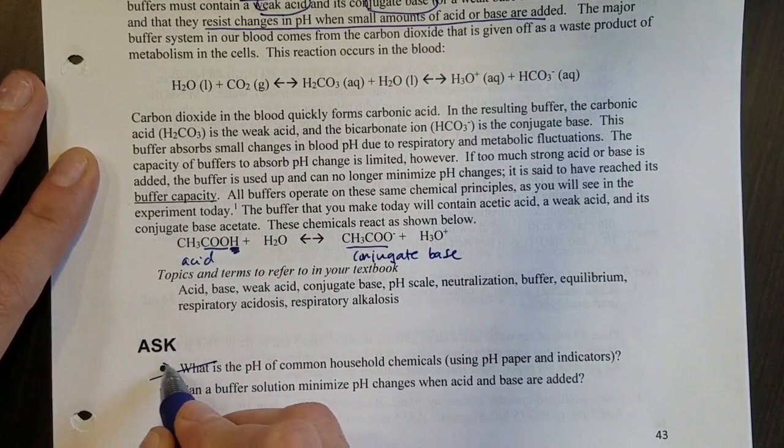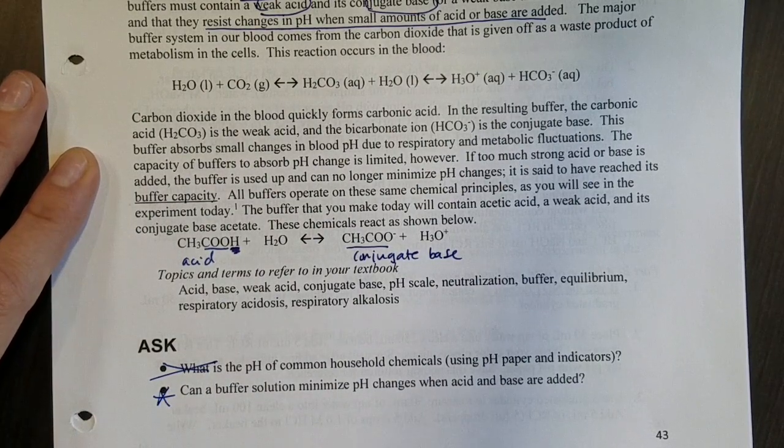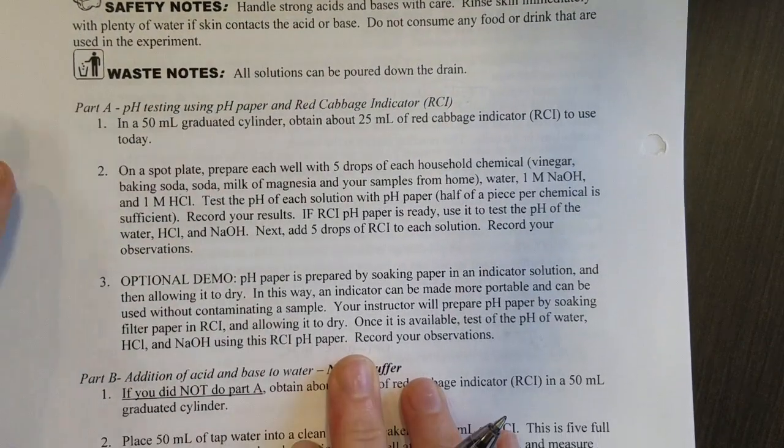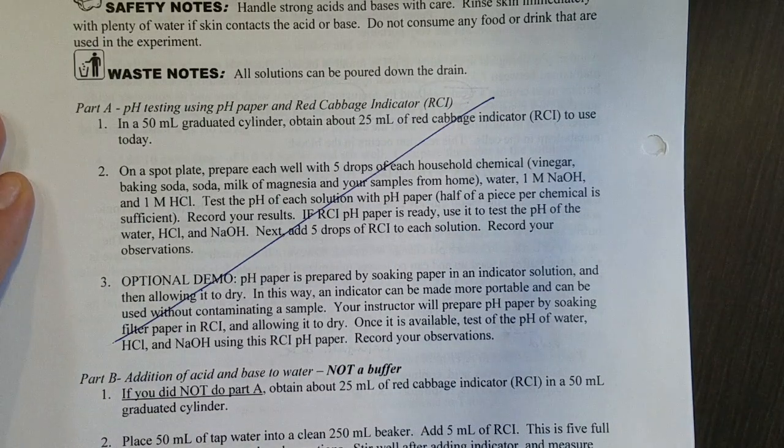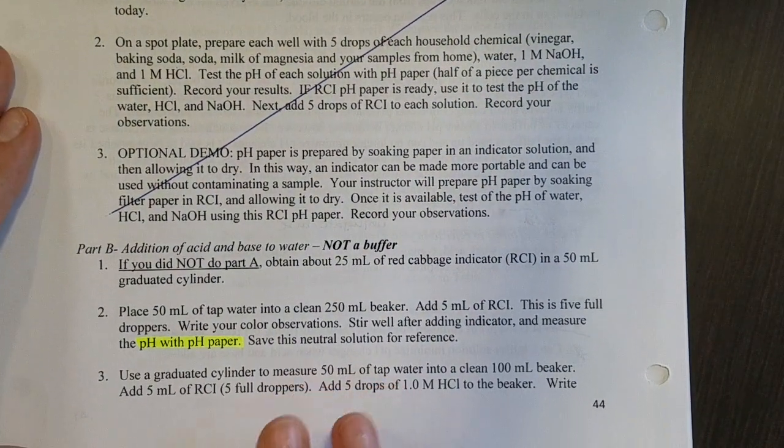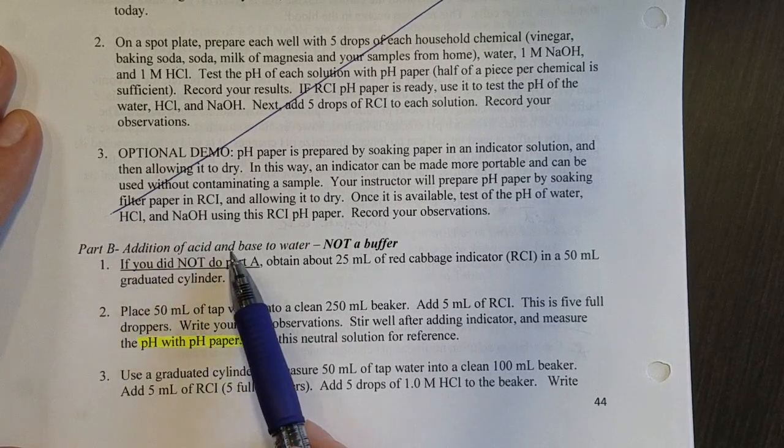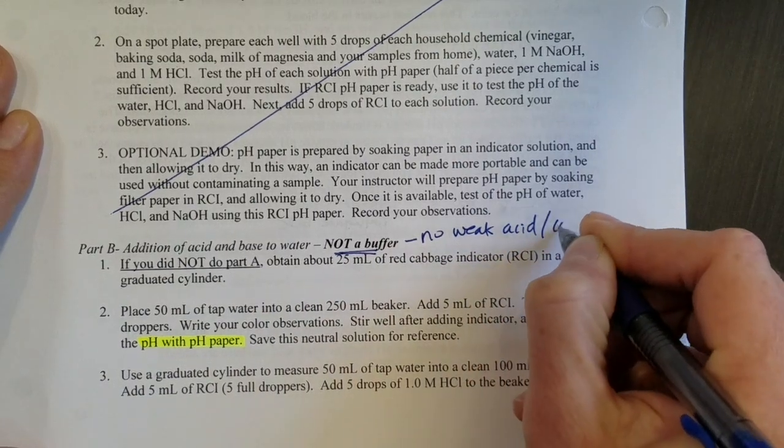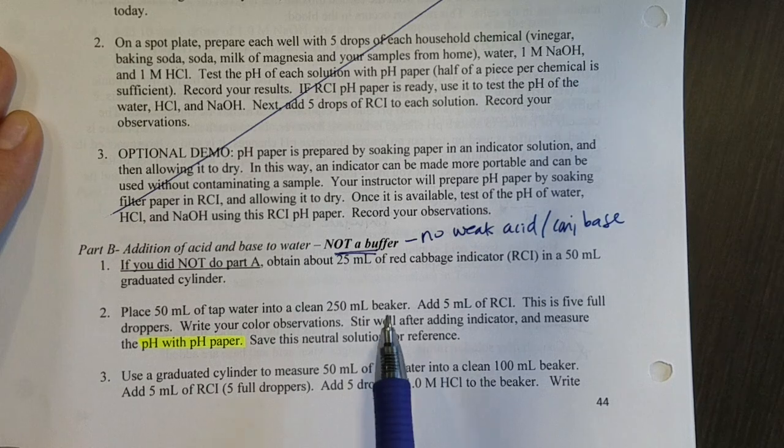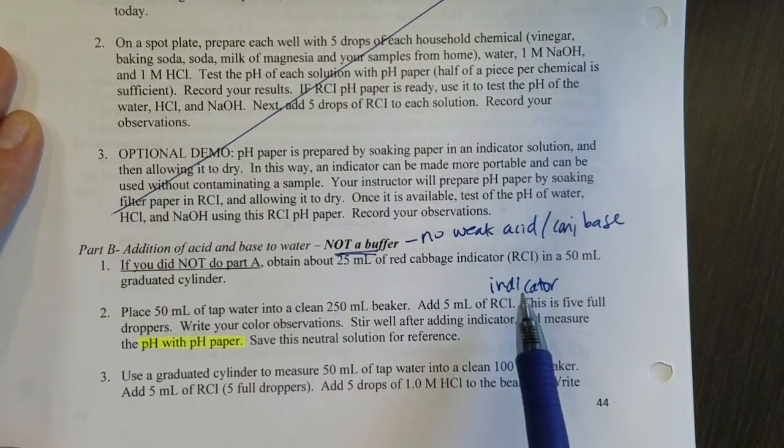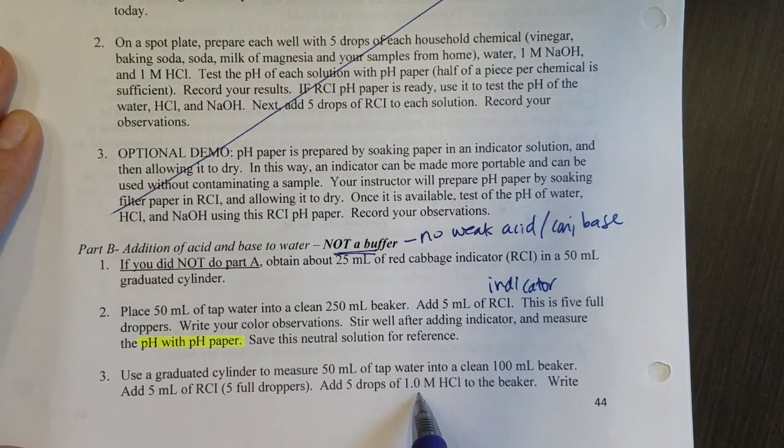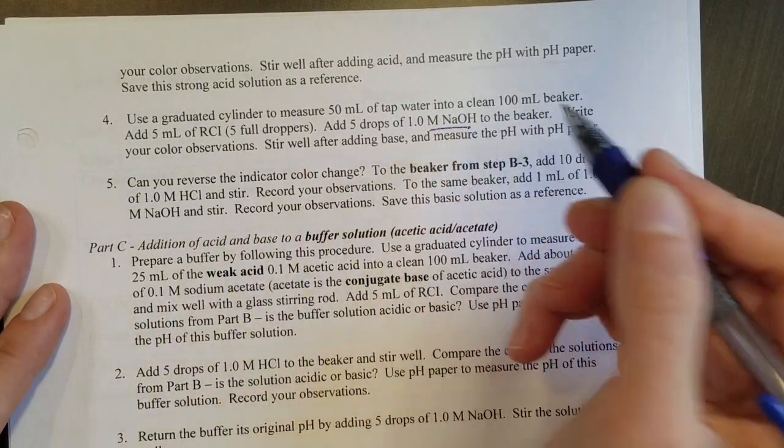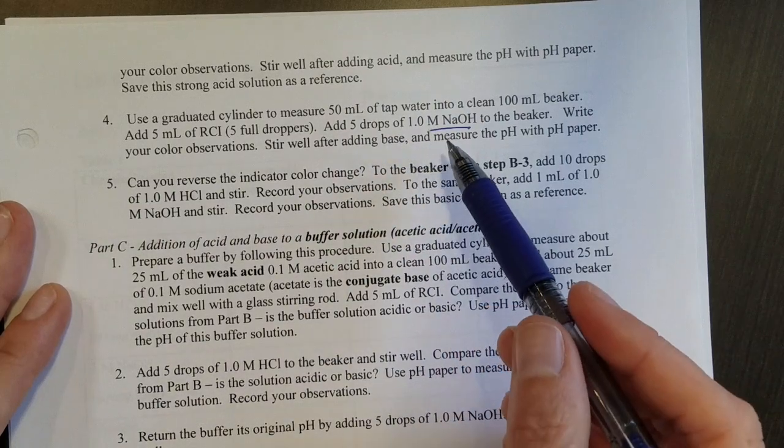So in terms of the questions we're going to look at today, we're going to skip this first one and we will instead just be focusing on this buffer. So next page over, I already collected all the equipment, was very safe while I handled it, and we are going to skip part A due to the difficulty of doing labs, but we're going to jump right to part B that you'll see in the video where we add an acid and base to water, something that is not a buffer. So in other words, it has no weak acid and conjugate base in it. So you're going to see some indicator, this RCI is an indicator that will be put into water and then we're going to add some acid to that. On the next page over, you'll see we continue, we will add some base to that water and then we'll play around with reversing that change. So you want to keep an eye on the colors and the chemicals that are added here.